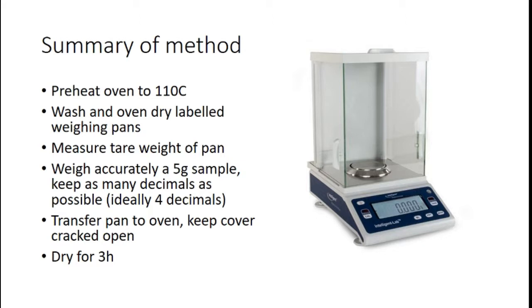Transfer your pan to the oven. In many cases, you'll have a small lid to prevent dust from falling into the sample and being inaccurately weighed, also preventing drafts and loss of the sample during handling. But make sure to keep the lid cracked open. I've seen students try to measure the moisture on a sample and have the lid sealed up so tightly that the moisture can't actually be transferred off of that sample during the heating process.